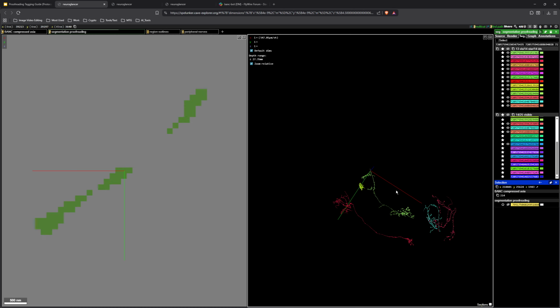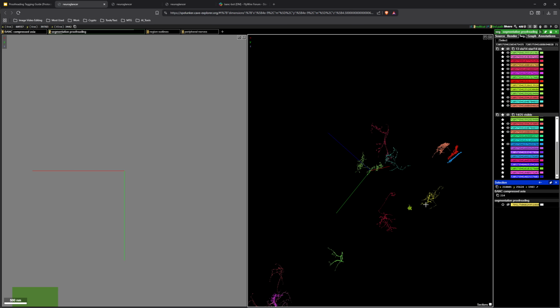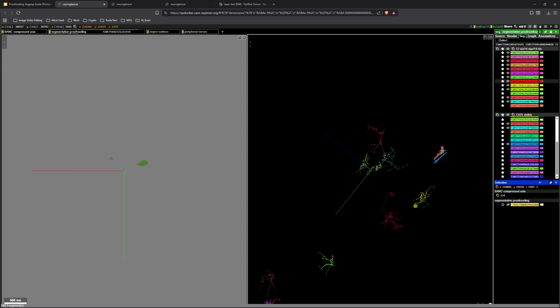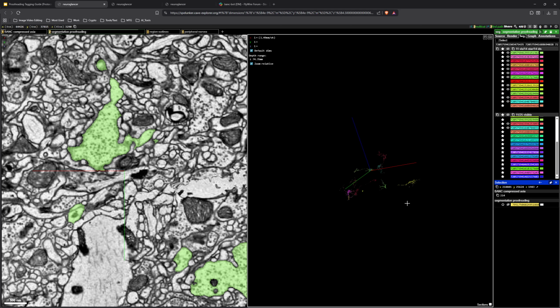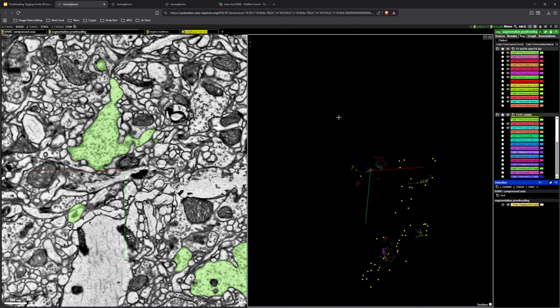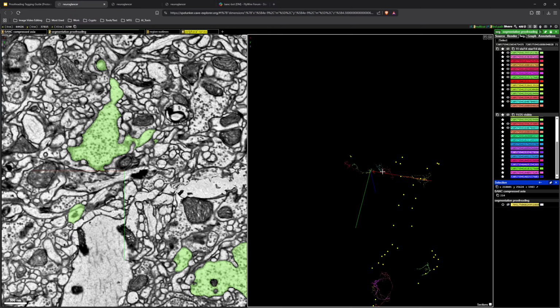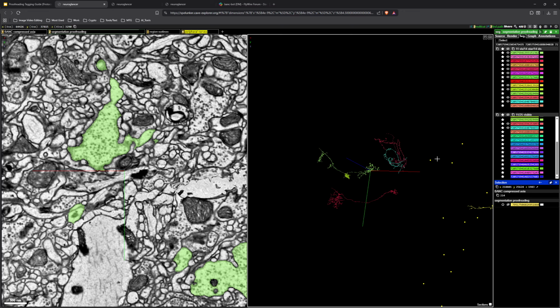But let's talk about some mistakes or traps that we might fall into that are unrelated to the sensory types. Sensory types are pretty easy to distinguish because of the peripheral nerves, right? But as you can see in this region, there are no peripheral nerve indicators.